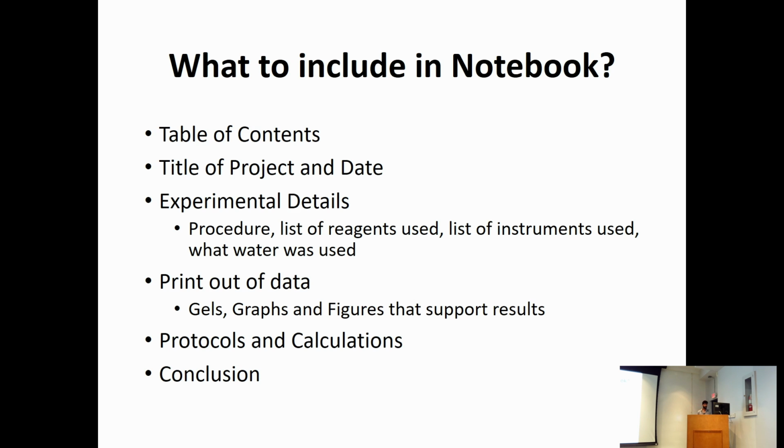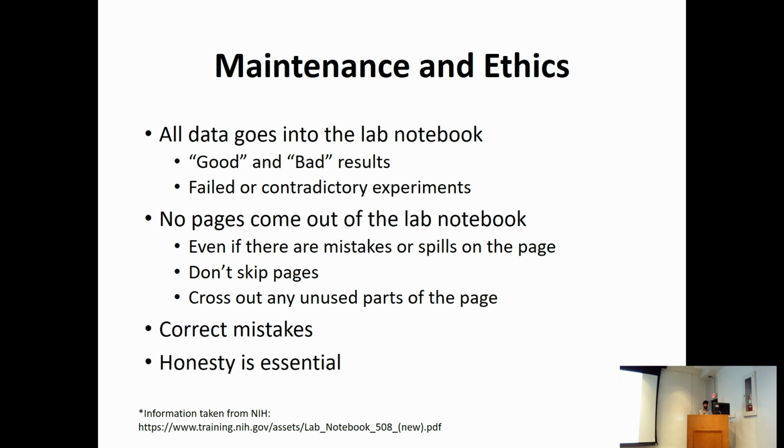your lab notebook. Then after collecting the data, you can find a way to present it in a manner like using a graph or figure or gel. Then with all the data, you can come to a conclusion from the experiment that I did, and you can write it down and document it in the lab notebook. So I think this is one of the most important slides in this session.